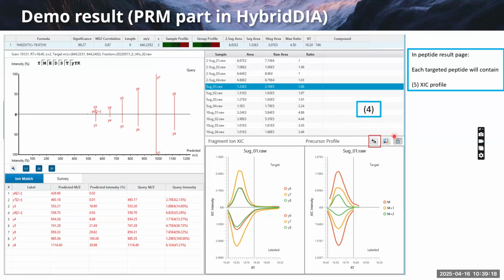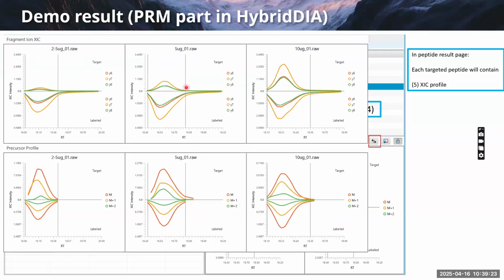So here we have a button. You can click this button to pick up at most, now we offer at most 4 samples, to do a comparison. Also our y-axis here is adjustable. You can see here for the MS1 it's clear the ratio of 1 to this is close to 4. Since these are spiking peptides, you can see the ratio is close. And since for the x-axis we use the raw area, I just adjust the y-axis here to give you this basic idea.